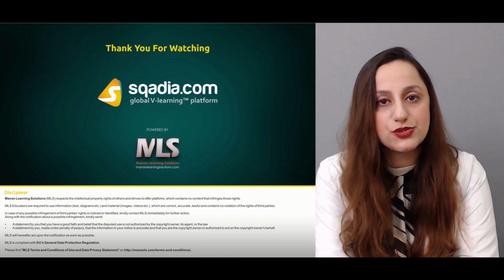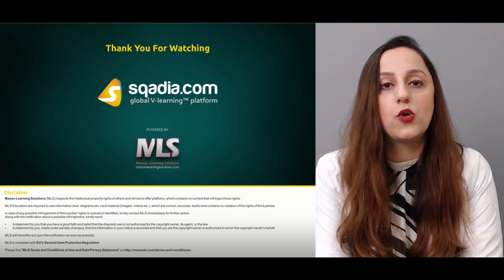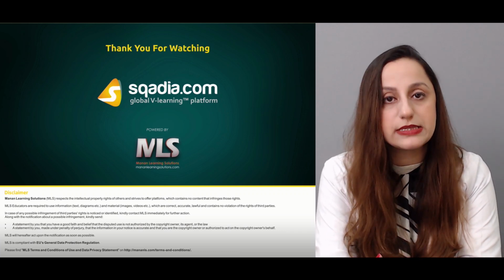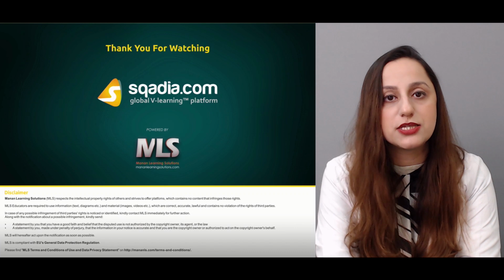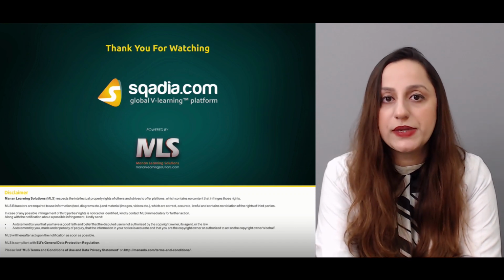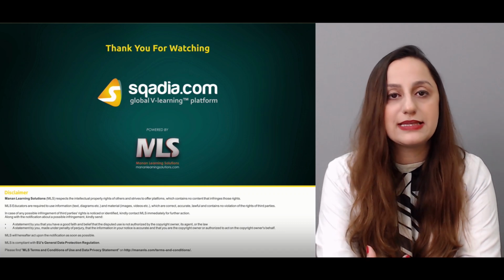So that was the end of this section. In this section, we dealt with the types of incisions that we are going to give in different situations: the I, the Y, and the modified Y-shaped incisions. What are the advantages and disadvantages of these incisions? And how do we start opening up the cavities? The main cavities are discussed, and how do we access the brain?